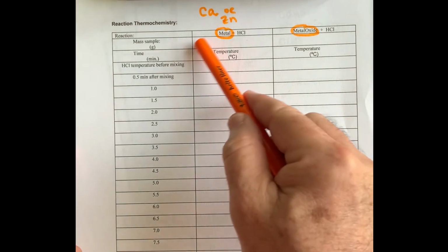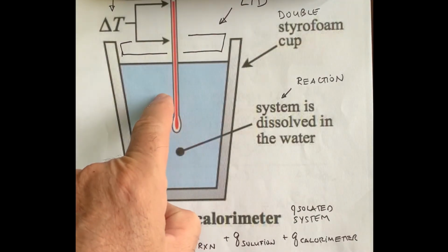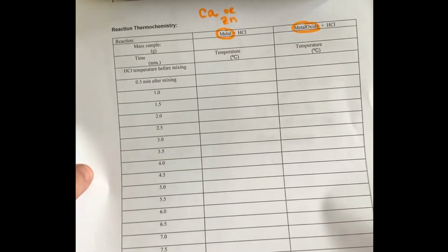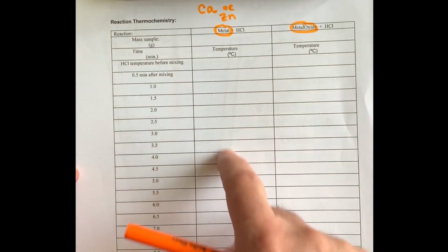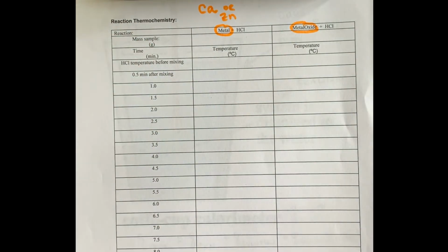So essentially you will start with a given mass of your sample, which you will combine with a specifically measured volume of solution of HCl, and you will have the tracking here of the temperatures again every 30 seconds, and you will use this to build a graph.